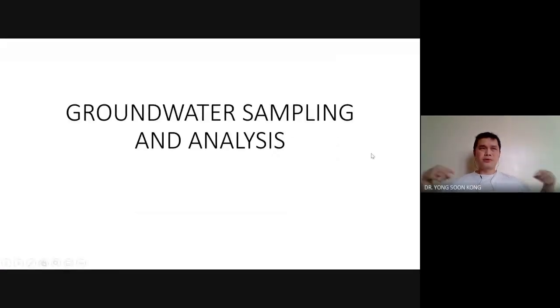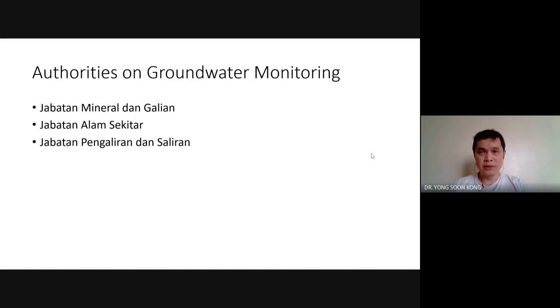So here I'm going to go into details regarding the techniques on how to draw groundwater from tube wells. Okay, a little bit of introduction. Who monitors groundwater? These three departments are responsible. Now it is said that if it's in the soil, it's under the jurisdiction of Jabatan Mineral dan Galian, in other words the Geology and Minerals Department. The office is in Ipoh.